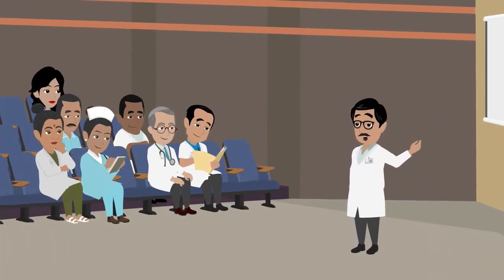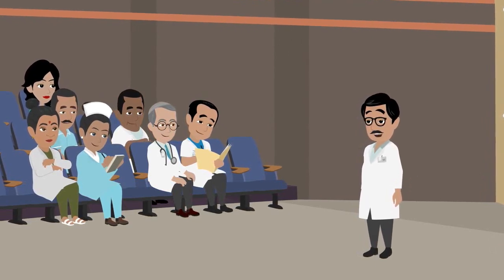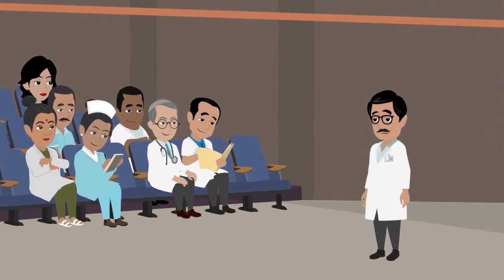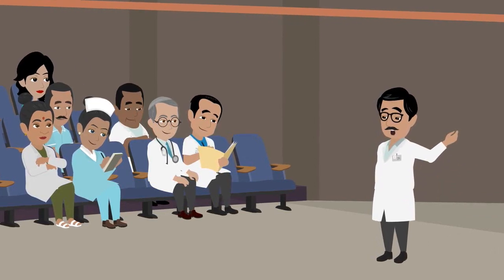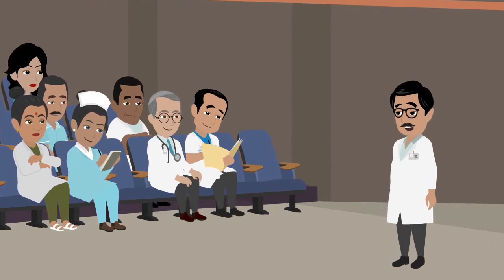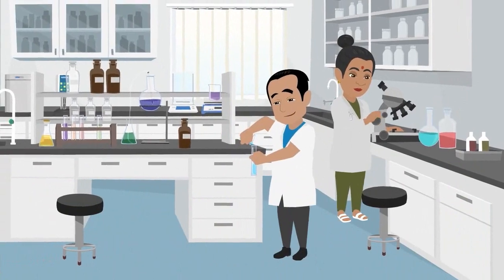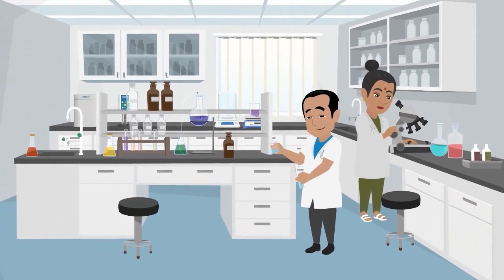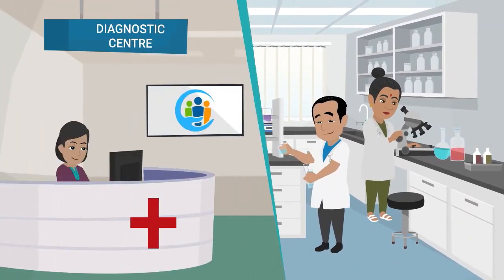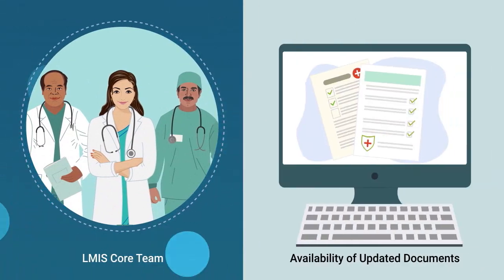For successful implementation of any LMIS application, labs must conduct training for all the stakeholders, such as doctors, lab technicians, pathologists, nurses, and admin staff. It is important to note that the training for every profession can be completely different from another. For example, the training of pathologist can be different from that of administration staff. At this stage, it is crucial for lab LMIS team to ensure that relevant training and updated documentation is available for all users.